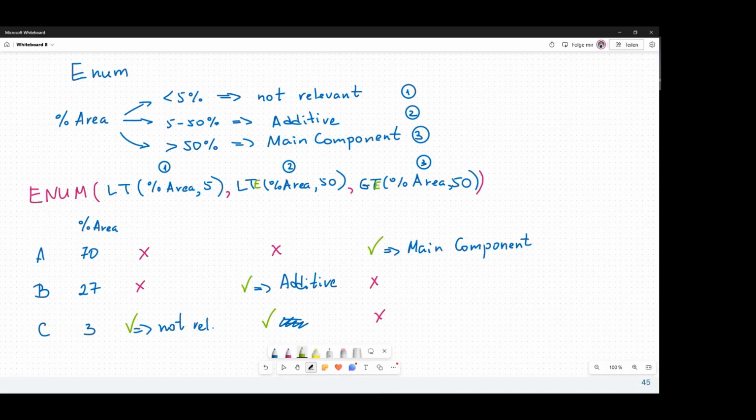Yeah. But I will say you never had this problem because you never get a peak like 50% with how many 13 decimals after it. 0.000000000. I hope you get it. So when I ask the question, is my peak equals 50? I never get this yes, because I never get 50.000000000. It never happens. But yeah, when we work in GMP, we should say, okay, it also can happen. And maybe you work with rounded values, then it certainly makes sense. Yeah, you're completely right. We also should put in case something is equal.